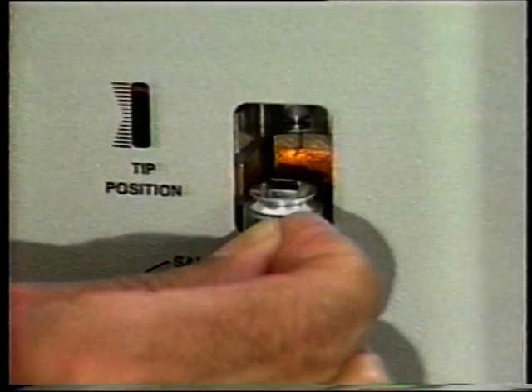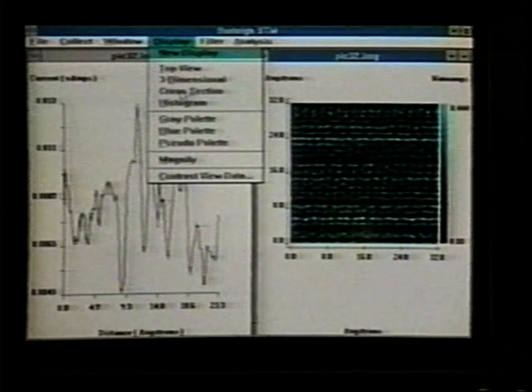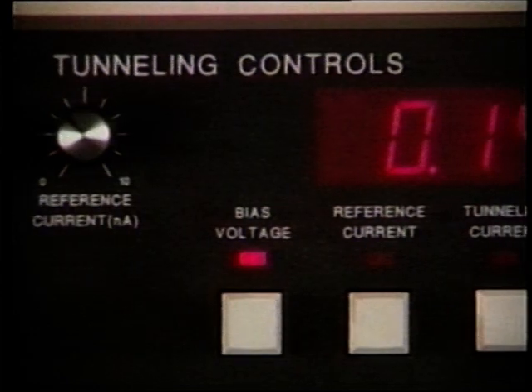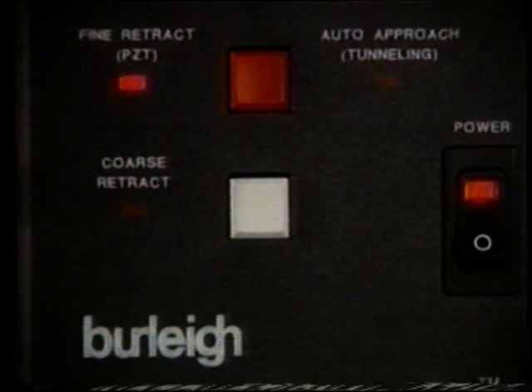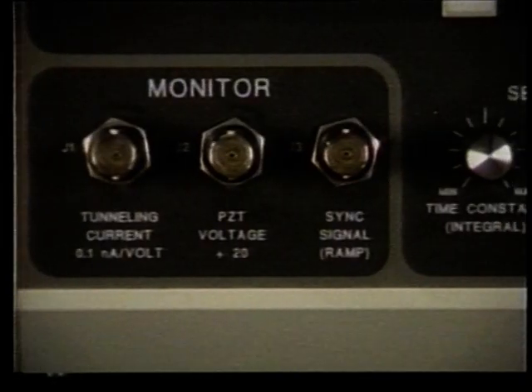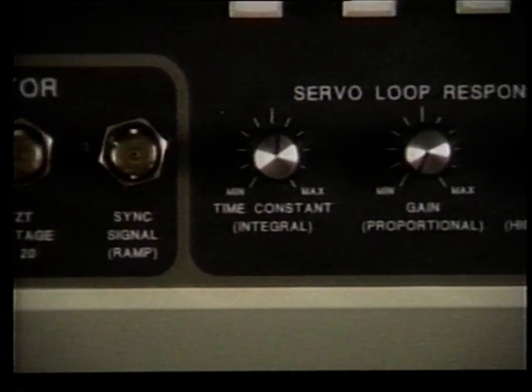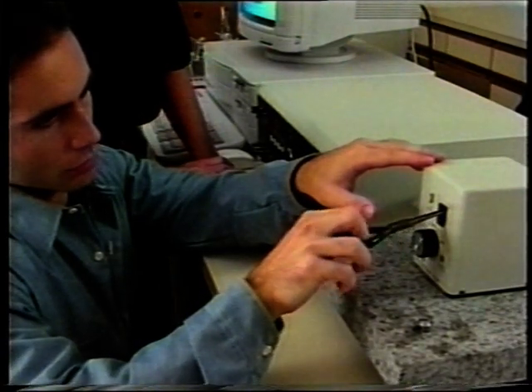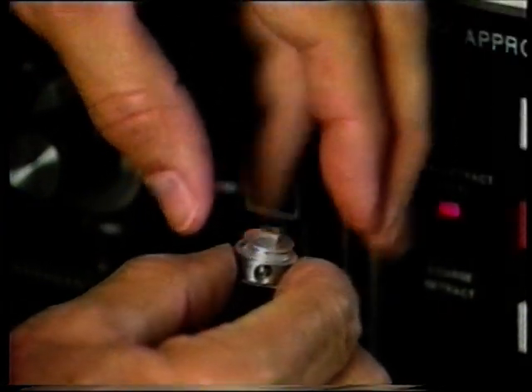This high-performance instrument is designed with Nobel Prize-winning technology and offers the highest resolution imaging and most precise physical measurement available today. The Burleigh Instructional STM represents the next generation in scanning tunneling microscope technology and makes the powerful new capabilities of the STM affordable and practical. It's a rugged instrument that can provide high-quality atomic resolution imaging quickly and easily. The system is designed for routine use with a provided set of samples and for investigative research of other materials.